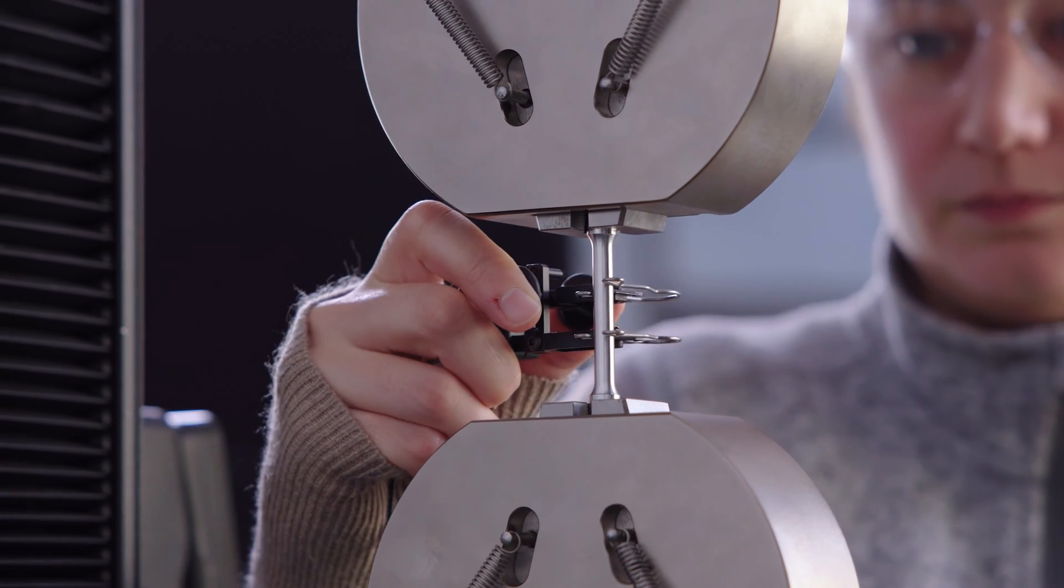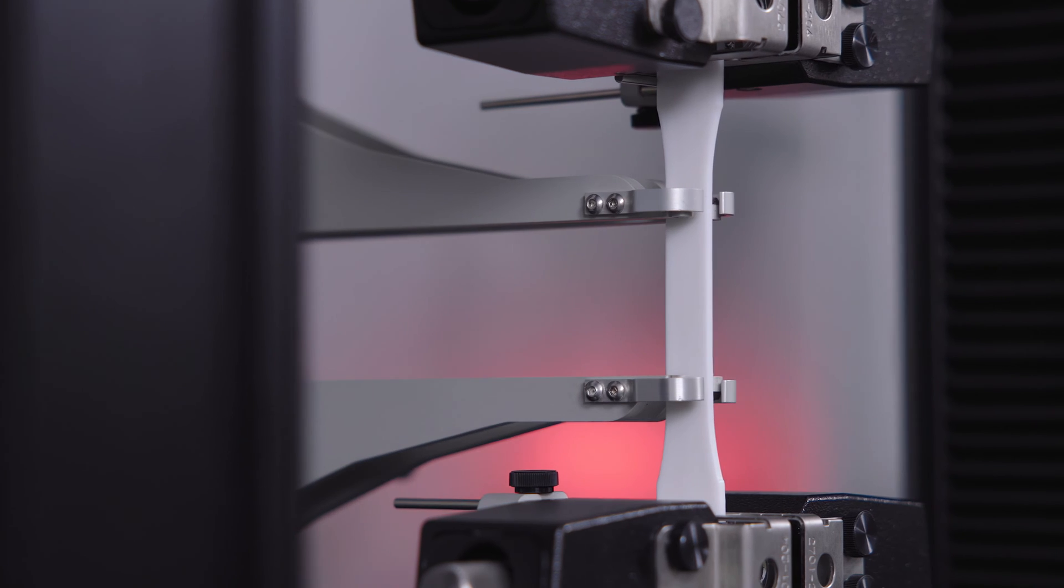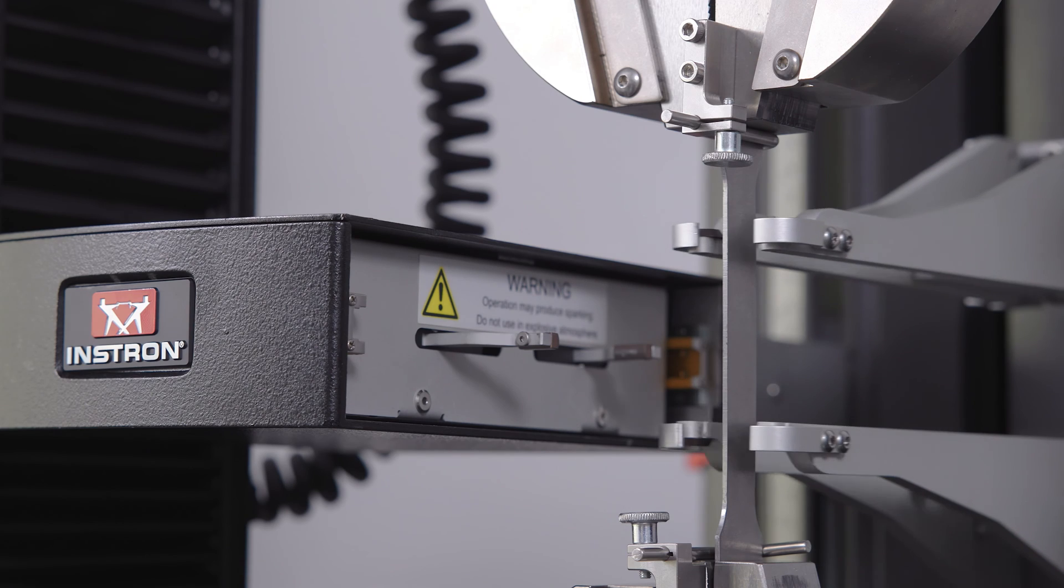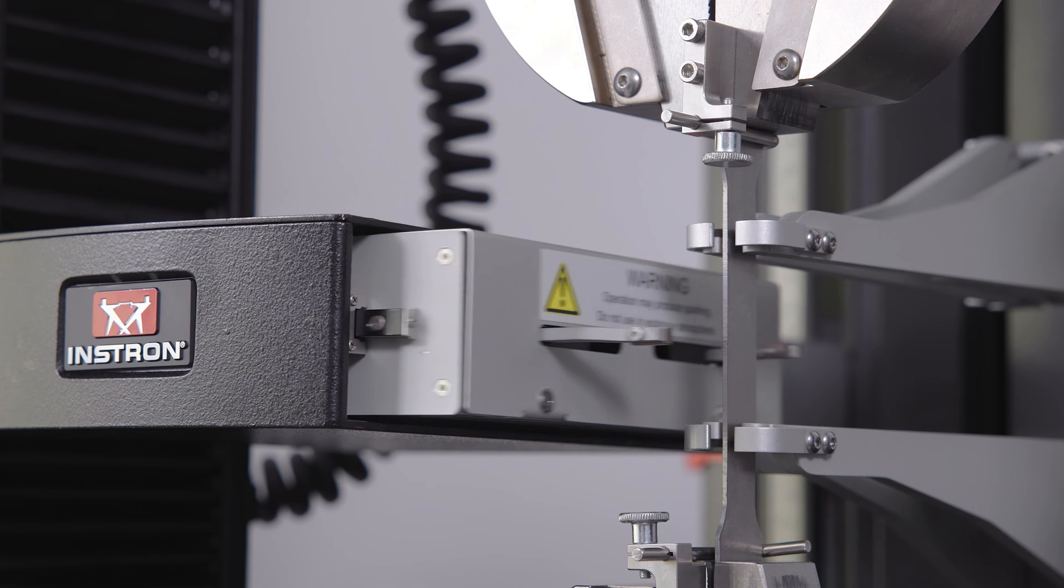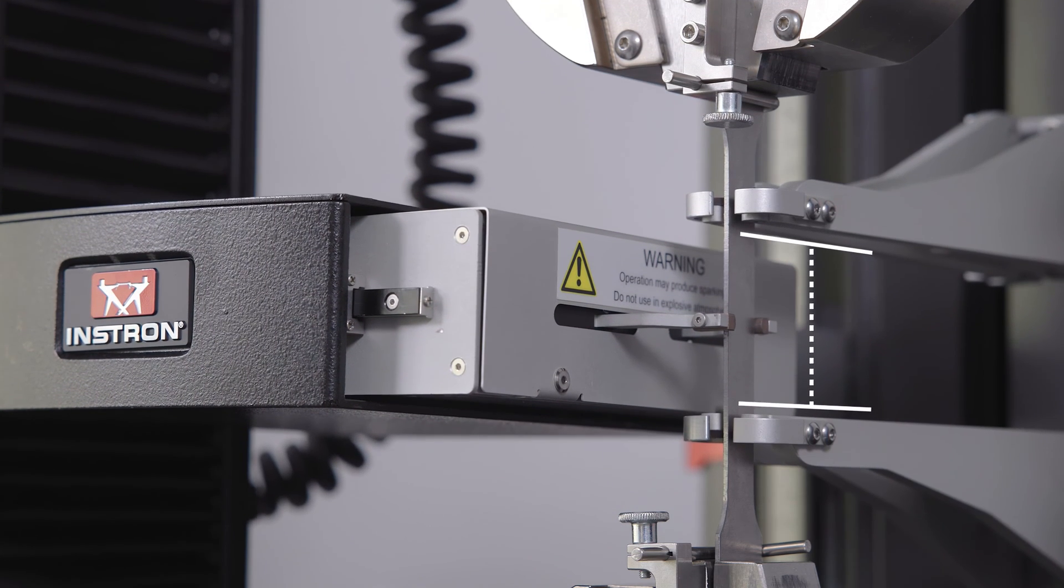Contacting extensometers can either be clipped onto the specimen or attach automatically. These devices use thin knife edges to touch the specimen, with strain measurement being determined based on the change in distance between the extensometer arms during testing.